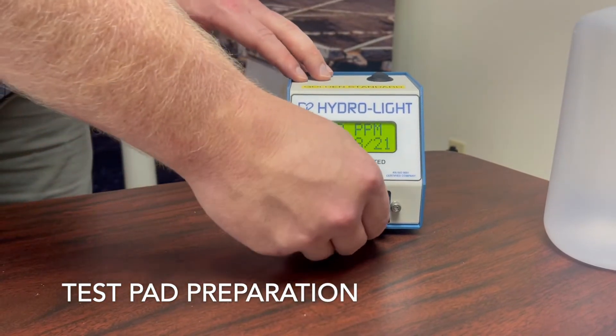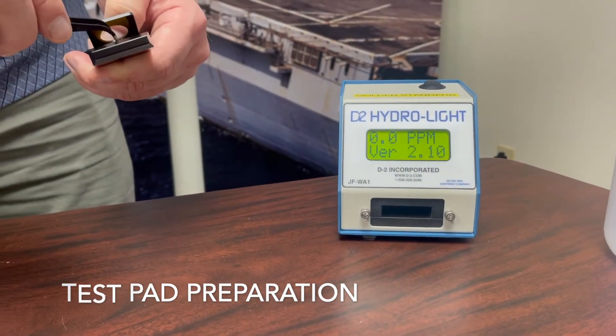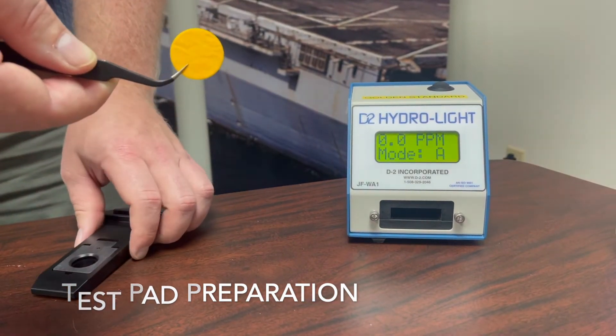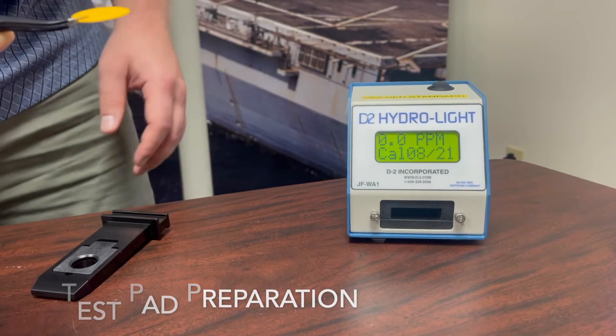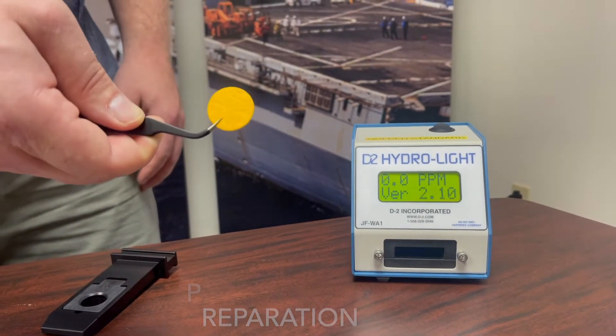The presence of free water in your fuel is visually observable on the pad, as the surface will change from an orange to yellow color. The more free water in the pad, the more the surface will fluoresce.